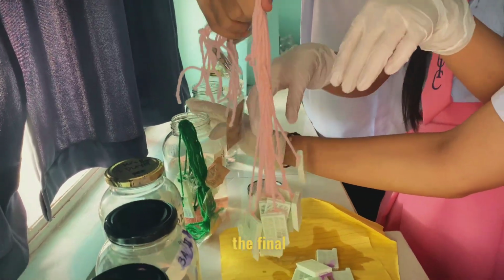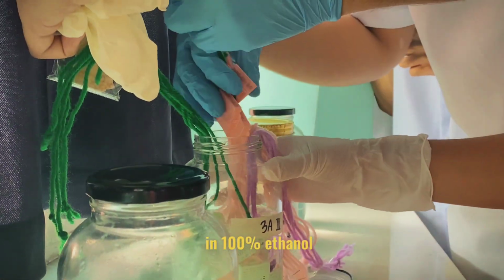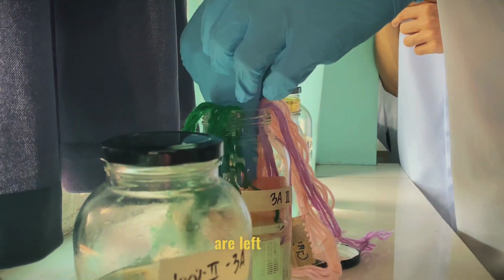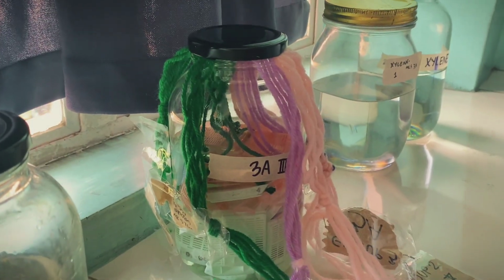Now, let's carry out the final dehydration step, again in 100% ethanol for 30 minutes. This ensures that we are left with completely dehydrated tissue samples.